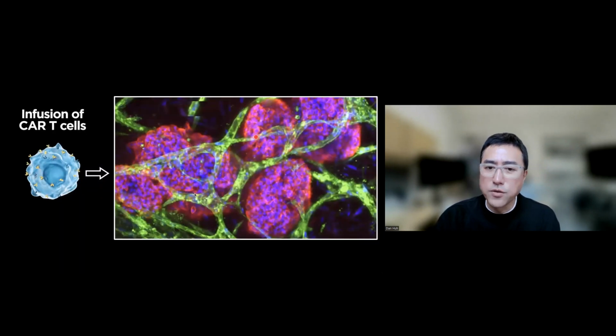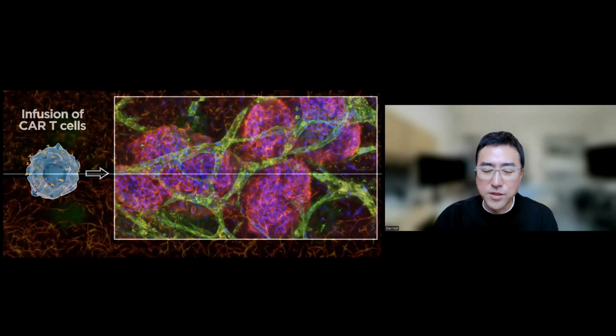So to model type 1 diabetes, or the immune-islet interactions, it would be ideal if you could get islets and T cells from type 1 diabetics, but the logistics of these kinds of studies are quite challenging. So what we're now trying to do is to use CAR T cells and engineer them to recognize certain antigens or surface markers expressed by islet cells, to simulate islet immune interactions in the system.